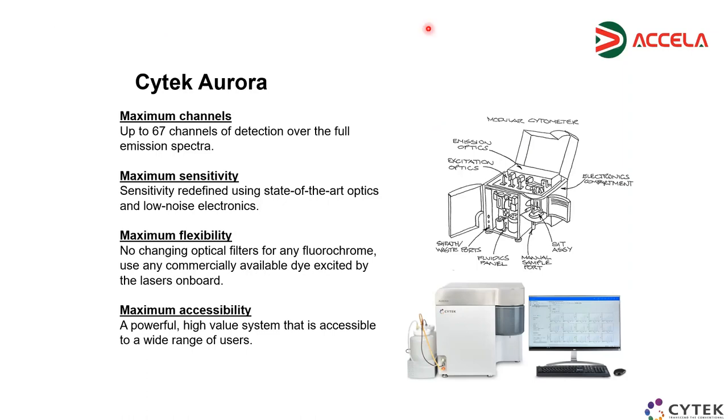Excuse me, would it be okay if I ask you a question like this? Yeah, sure. We are not so many, so it's fine. Not a problem. So you said that in the workflow, you acquire the reference spectrum with single labeled cells. Do you have some kind of a database of reference dyes that you can just load without acquiring single labeled samples, or is this an absolute requirement?